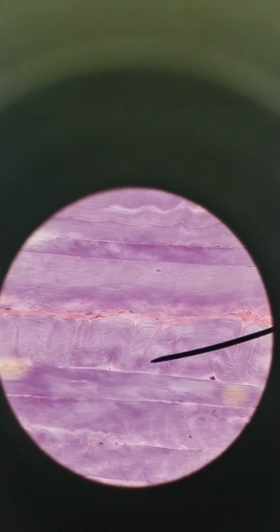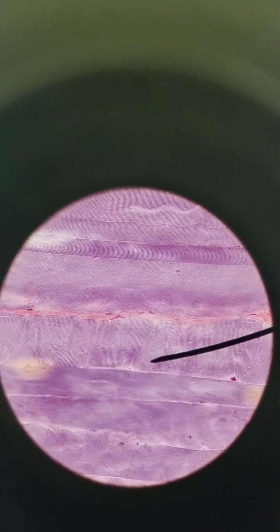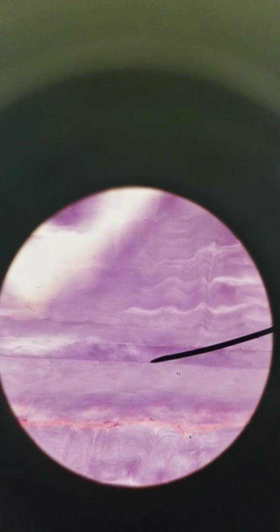And you can see the protein, well, not individual proteins, but you can see the arrangement of proteins with these striations. Striations represent the arrangement of the proteins for contraction within muscle fibers. We see it in skeletal muscle, and we'll also see it in cardiac. So the darker lines are called anisotropic bands, but you can just call them A bands. The lighter lines are called I bands or isotropic bands. A bands are darker, I bands are lighter. And you have this repeating pattern over and over of dark and light bands. It's because of the repeating pattern of sarcomeres. And when I show you the sarcomere model, that'll make a lot more sense.